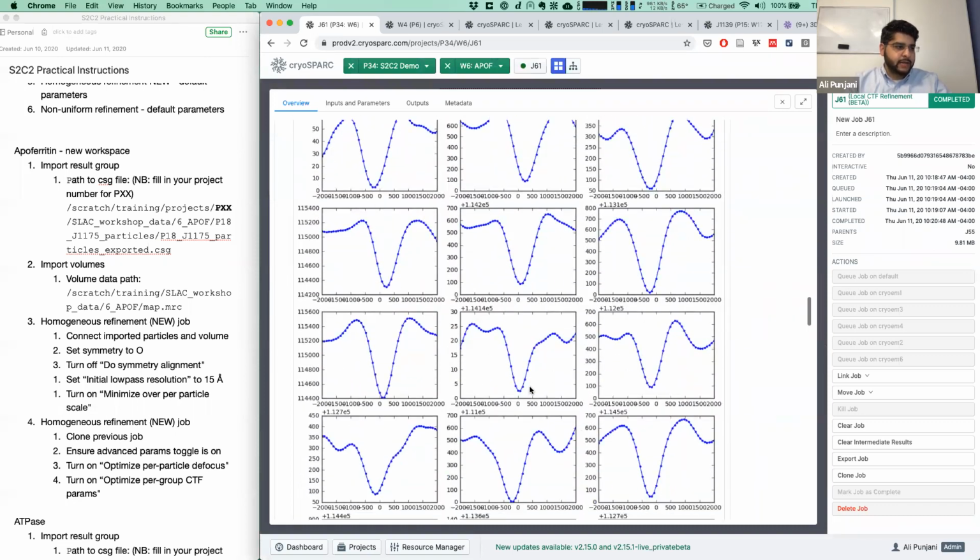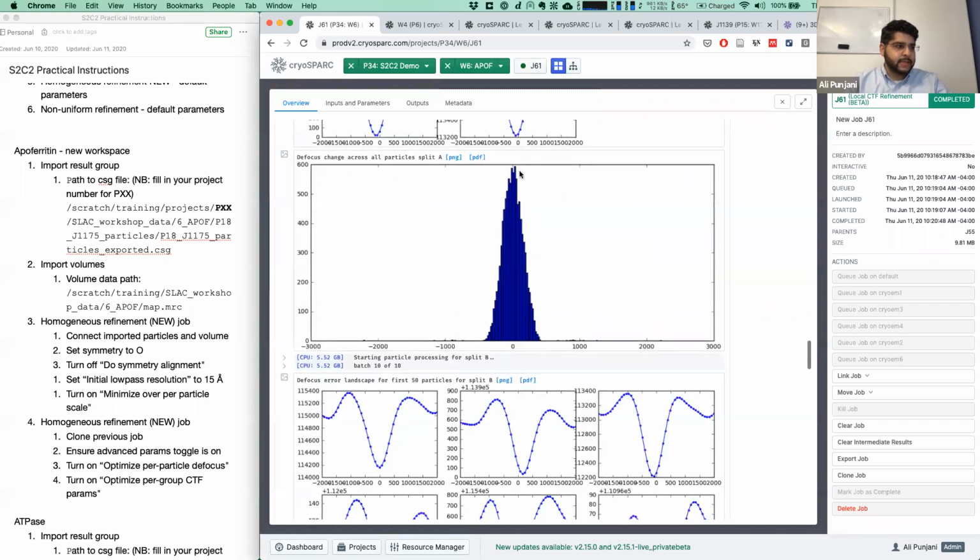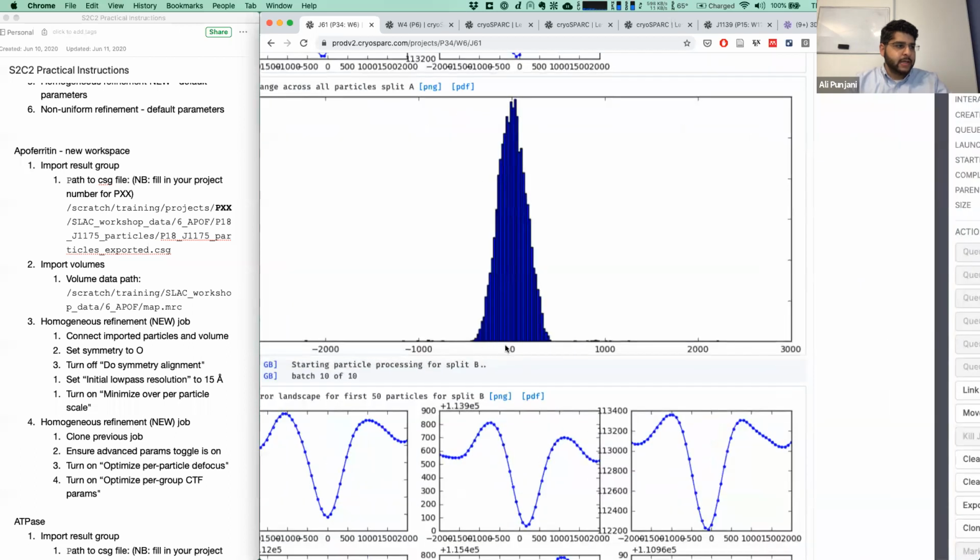Together, those are aggregated. There's lots of them plotted here. Those are aggregated into this histogram, and we can see that lots of particles have an updated defocus as much as plus or minus 500 angstroms away from where we thought the particle was. And that's actually literally tracking the height of the particle in the ice. If the ice was only 1,000 angstroms thick, then we're looking at particles moving from one surface or the other surface of the ice, or anywhere in between.